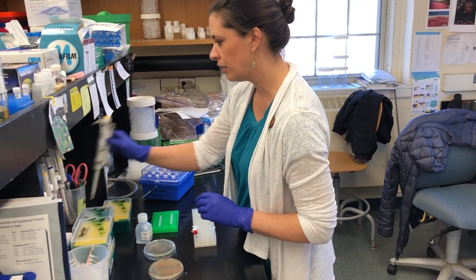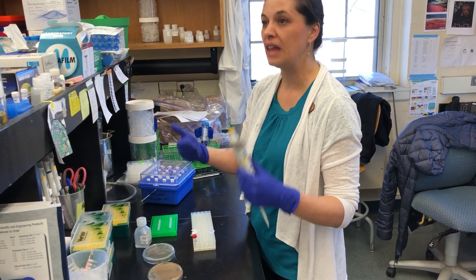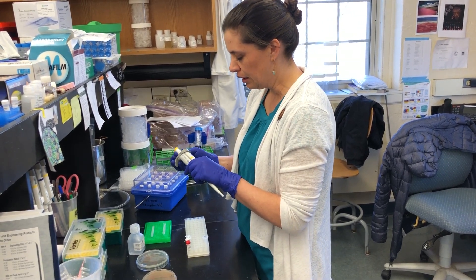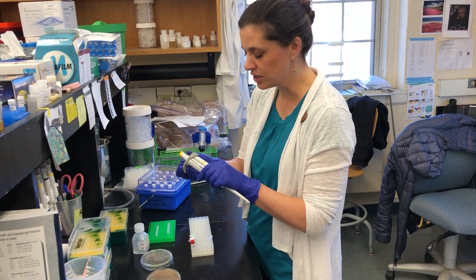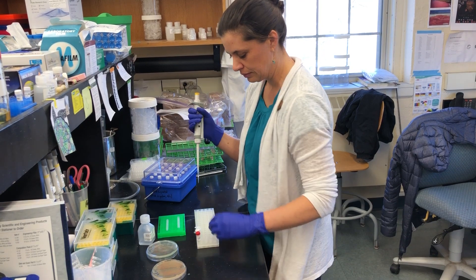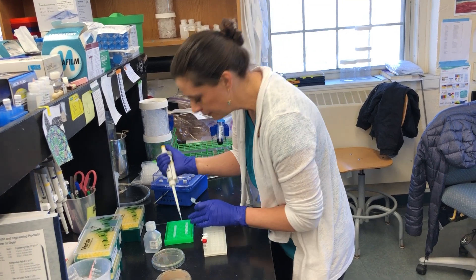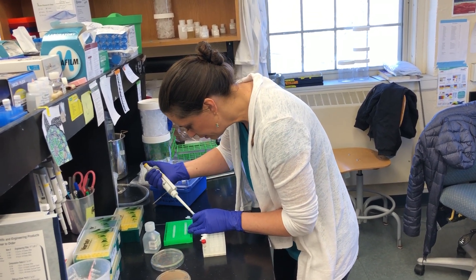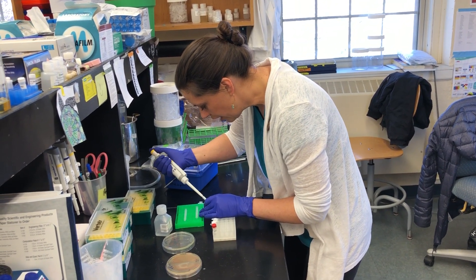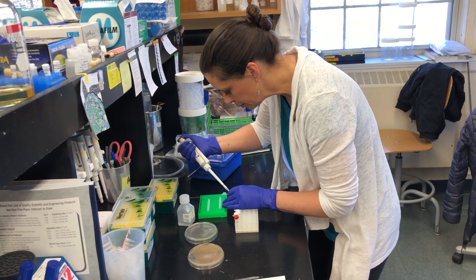I'm doing 20 microliter PCR reactions. That is helpful to do that or larger so that you don't end up with too much DNA in your PCR product. Sometimes when I do 10 or 15 microliter reactions, it gets pretty concentrated to load onto a gel. Since I'm not adding a template that has volume, it'll just be a few cells. I've already marked which colonies I'll be screening from on the plate, so I don't get mixed up when I see the product.